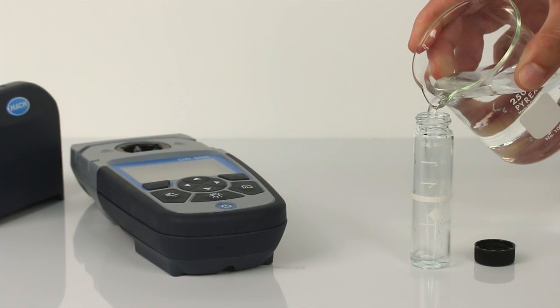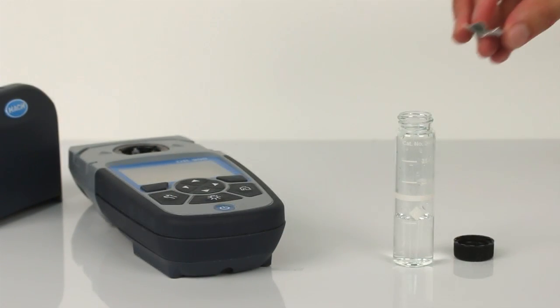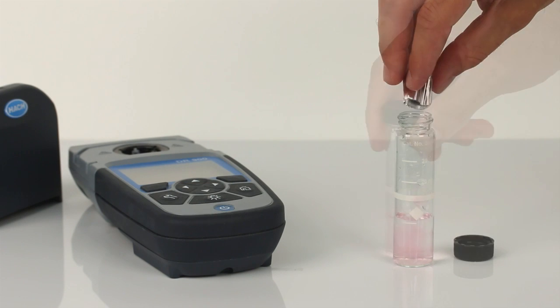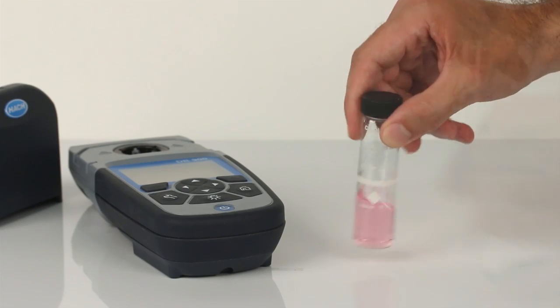Fill a second sample cell with 10 ml of sample. Add the contents of one powder pillow to the sample cell. Swirl the sample cell for 20 seconds to mix. A pink color will develop if chlorine is present.